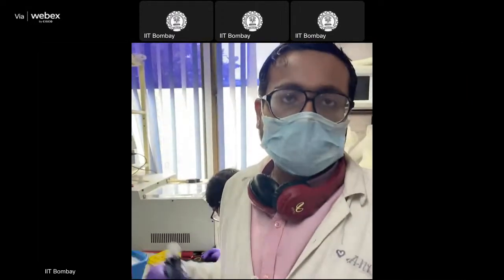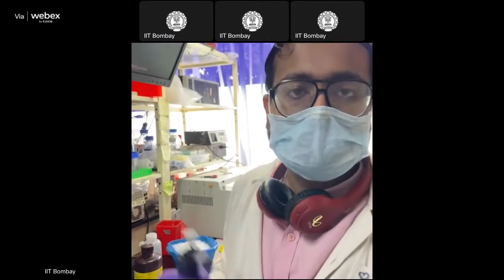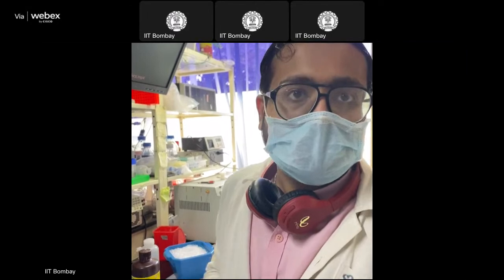Accurate estimation is quite important, because the next step is digestion, so we need to know how much protein we have, and this step is very crucial.